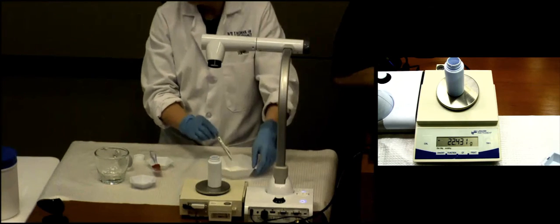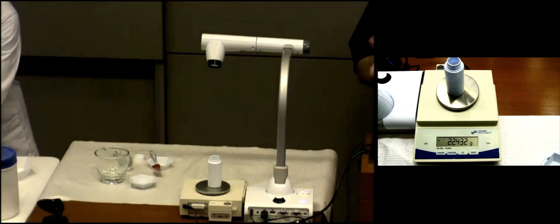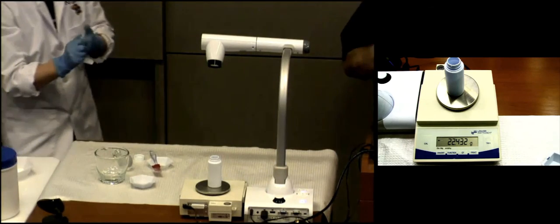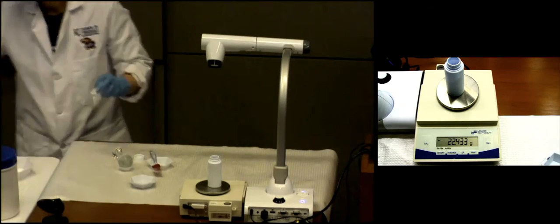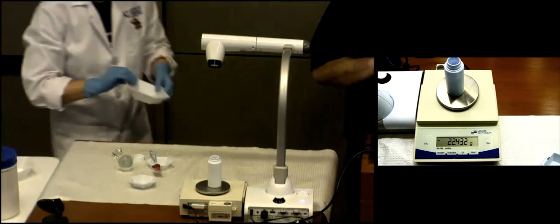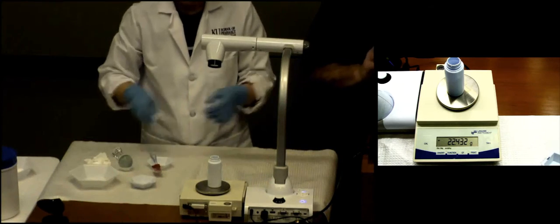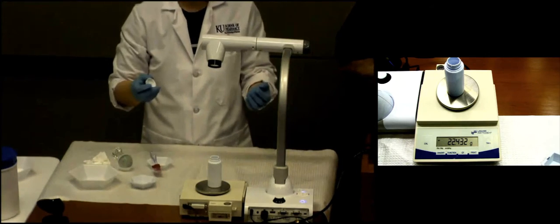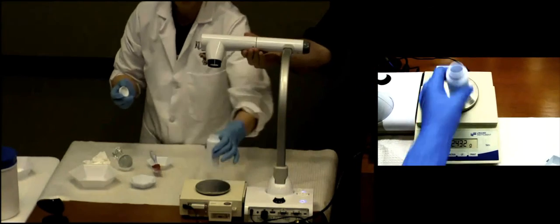Now, are you happy with that? Do we need to write that down somewhere? Yes, that number needs to be written down in the QA section. To the right of the compounding record with all your ingredients under QA, you'll see the top line says final product weight or volume. So extremely important to document what's being dispensed to the patient is exactly 22.432 grams. All right? Okay, but that's not it yet.